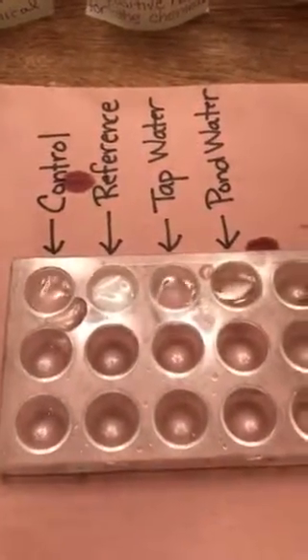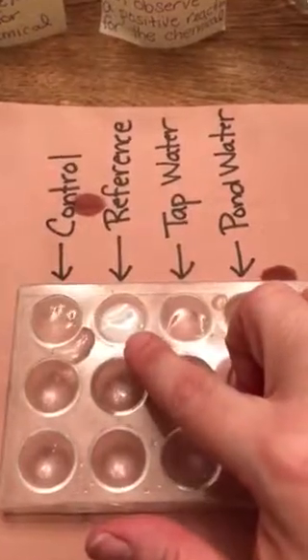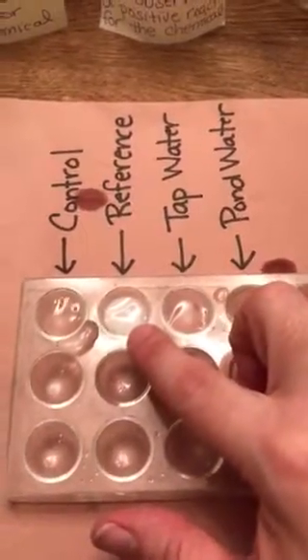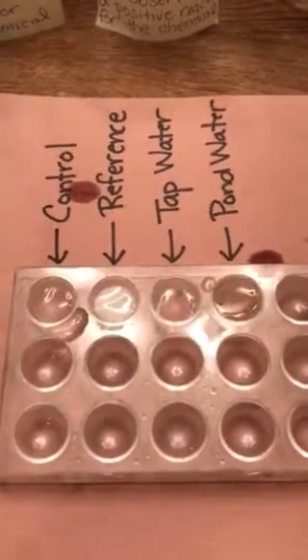Now you're going to do this for 3 ions, and the reference could end up looking like this as a positive test, or you might see something else, and that's why it's really important to look at that reference.